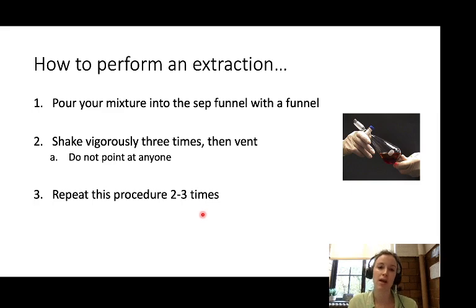Now, in more detail, how do we do an extraction? So we'll set up our SEP funnel. A SEP funnel is pictured here on the slide. At the top, we have the stopper, we have the body of the SEP funnel, and then we have the stopcock apparatus that lets the SEP funnel open and close.